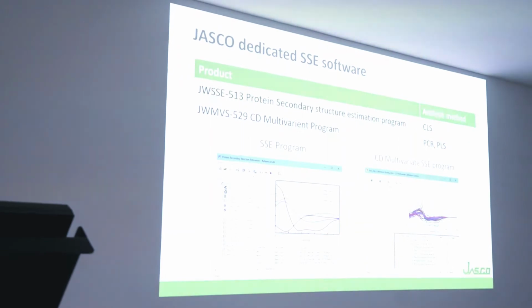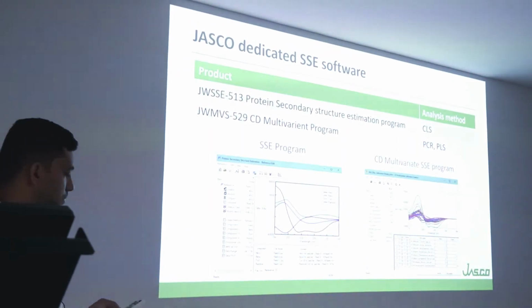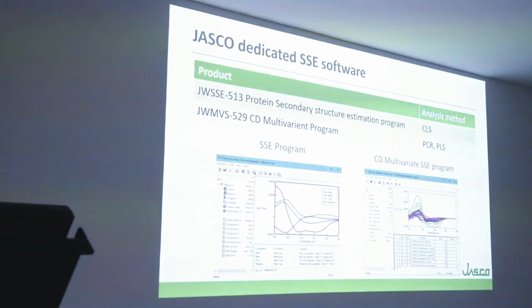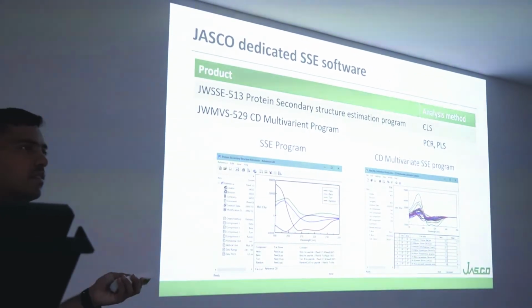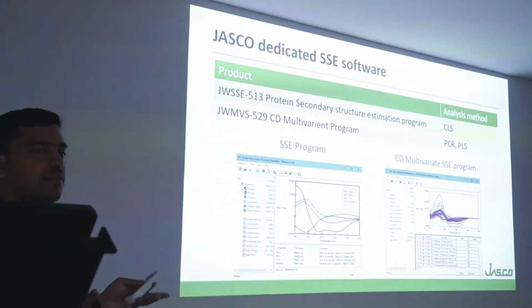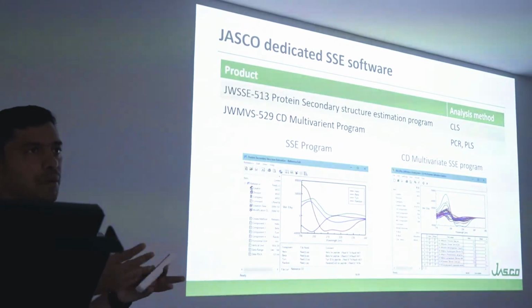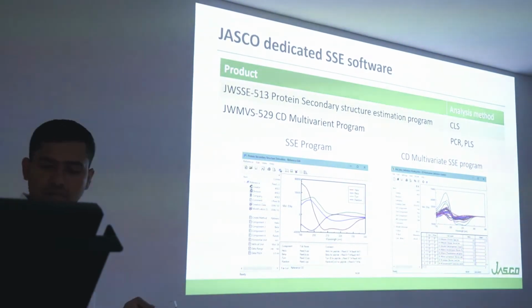Those will be for unknown proteins. Likewise, people ask why they get a different result many times. Because one day I'm analyzing one sample, and there are different parameters, including during sample preparation. How you prepare samples is also very much important. Different things are there.